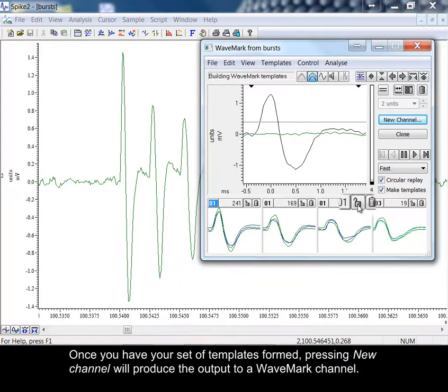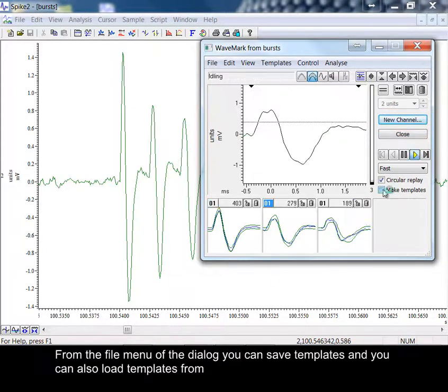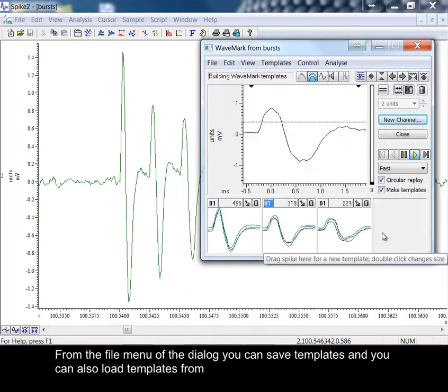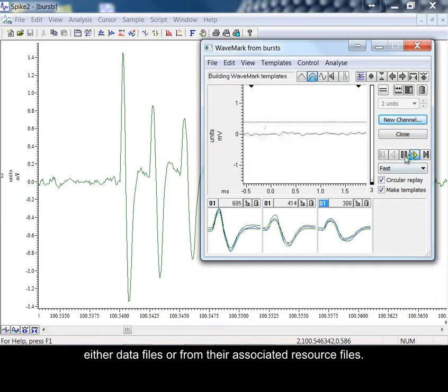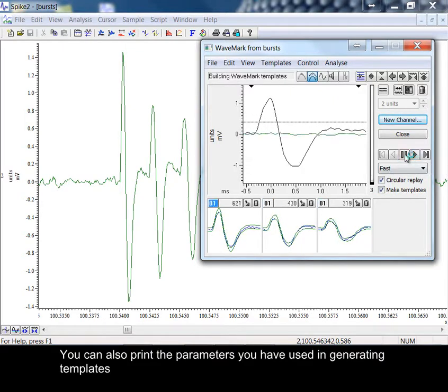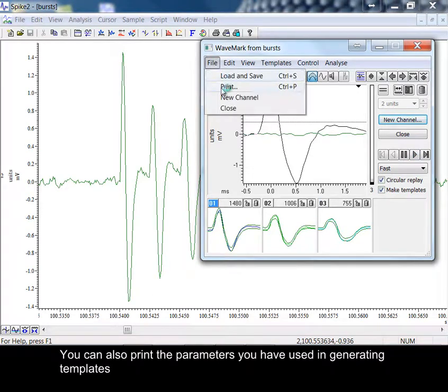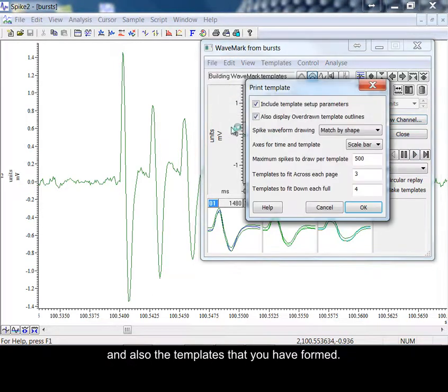Once you have your set of templates formed, pressing New Channel will produce the output to a wave mark channel. From the file menu of the dialog, you can save templates and you can also load templates from either data files or from their associated resource files. You can also print the parameters you have used in generating templates and also the templates that you have formed.